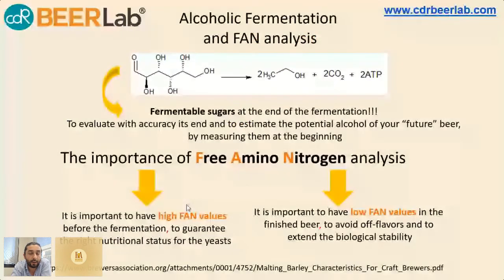Okay, here we have a focus on the free amino nitrogen analysis, which is actually a very important test in the quality control of the beer, because, as you know, you need to have high free amino nitrogen values before the fermentation, because the free amino nitrogen is the nutrition for your yeasts. So it's better to have a high free amino nitrogen level before starting the fermentation.